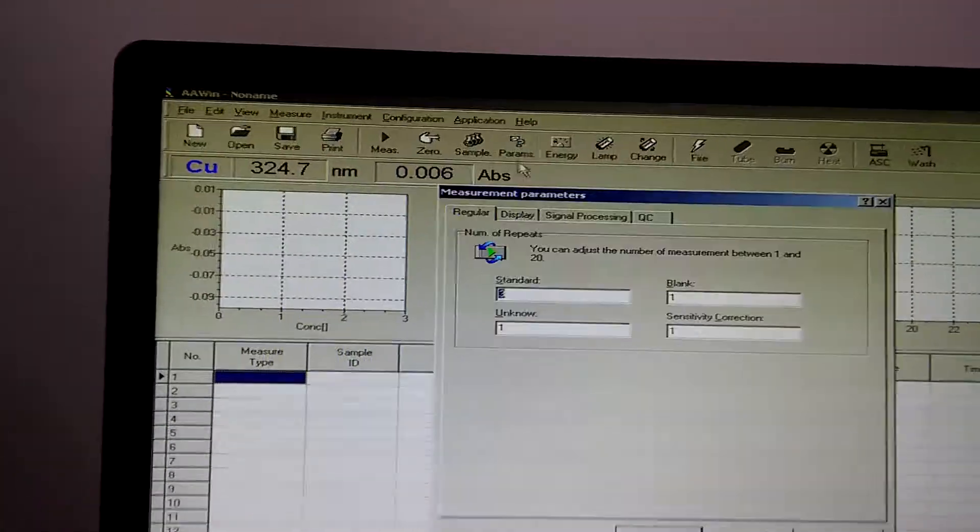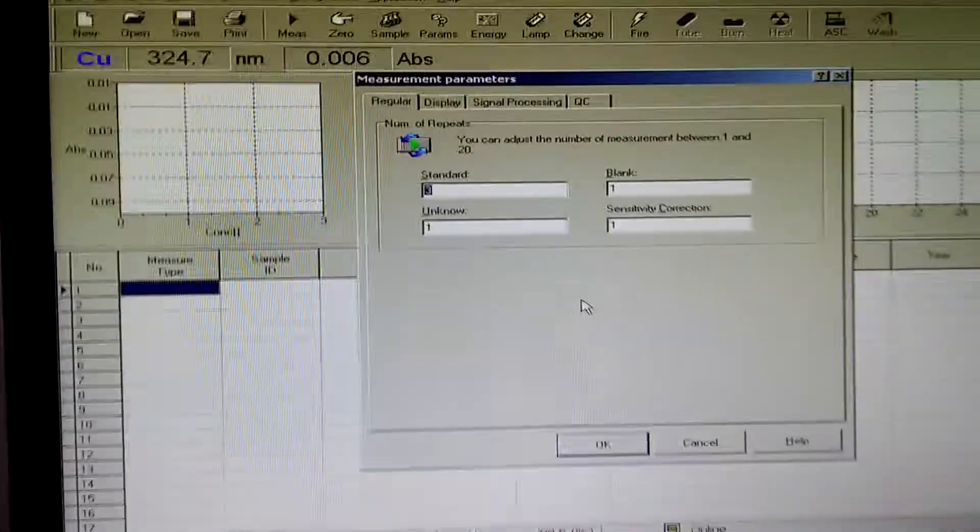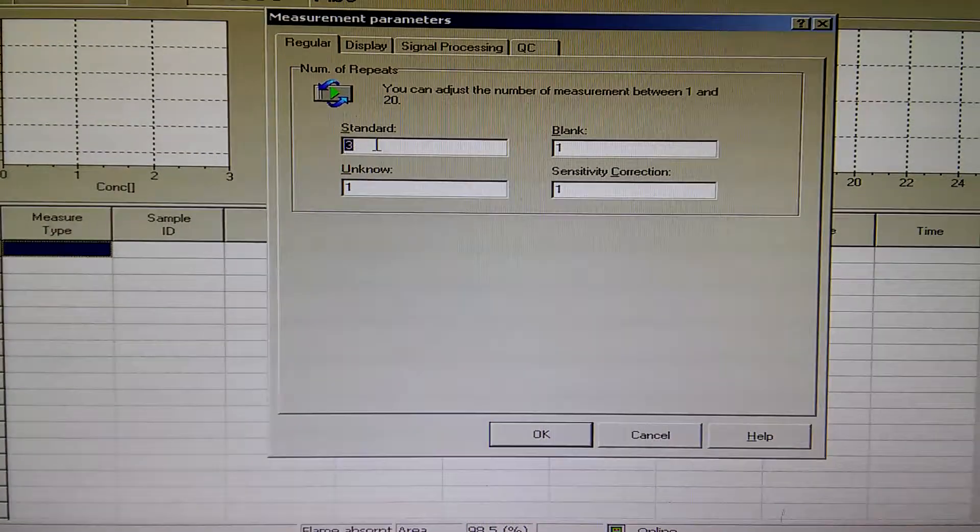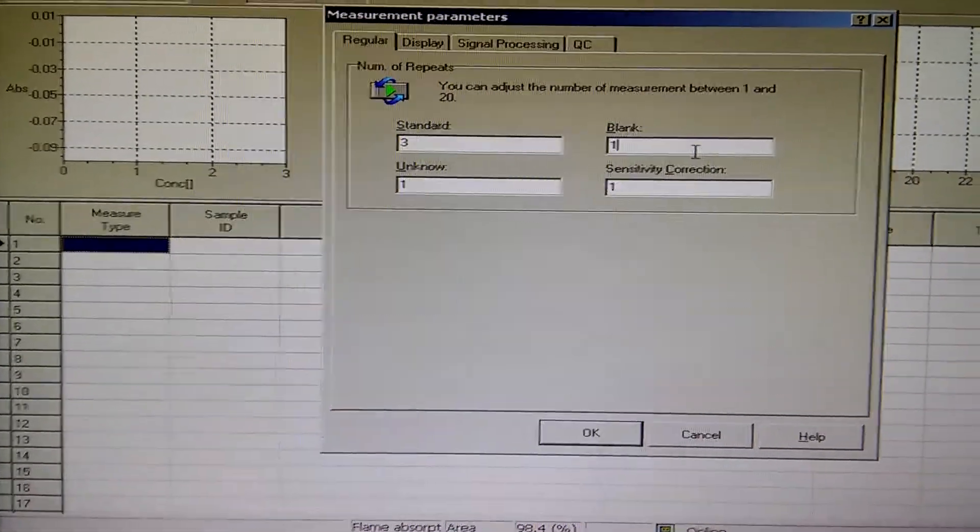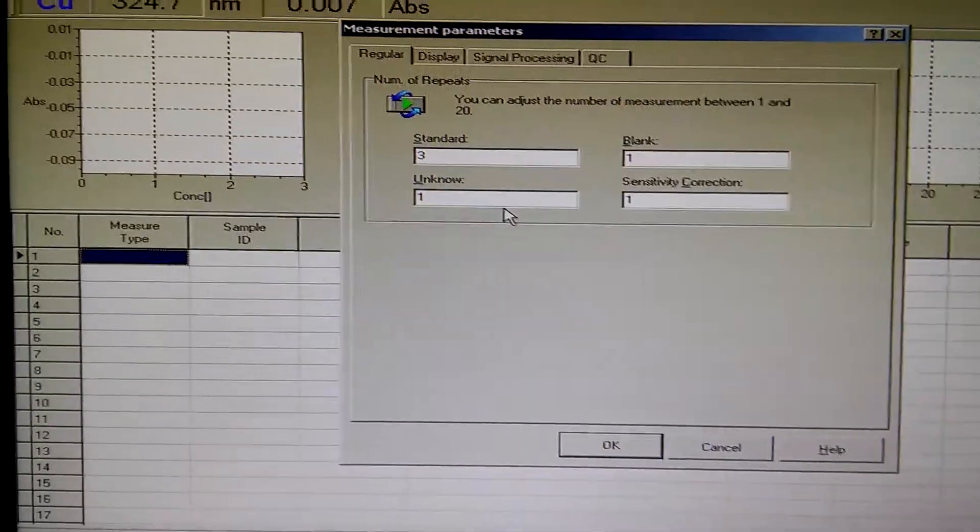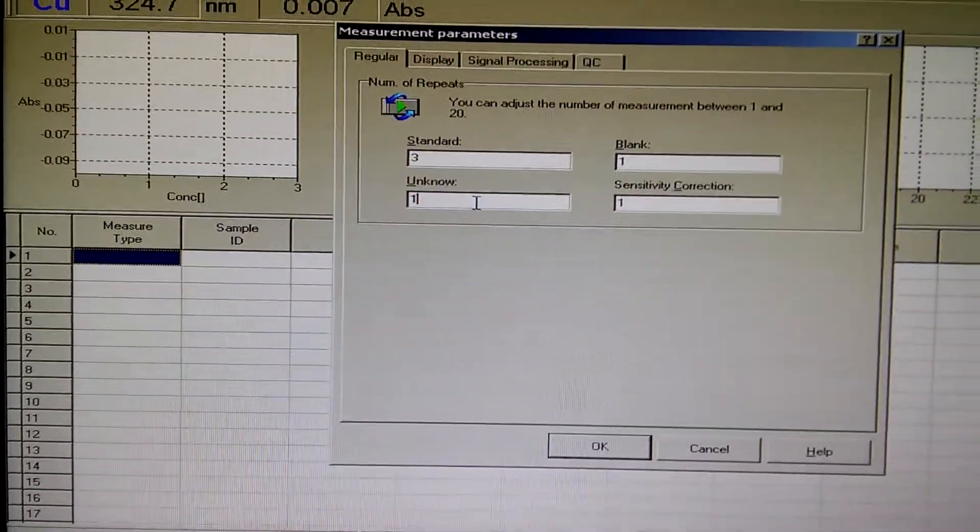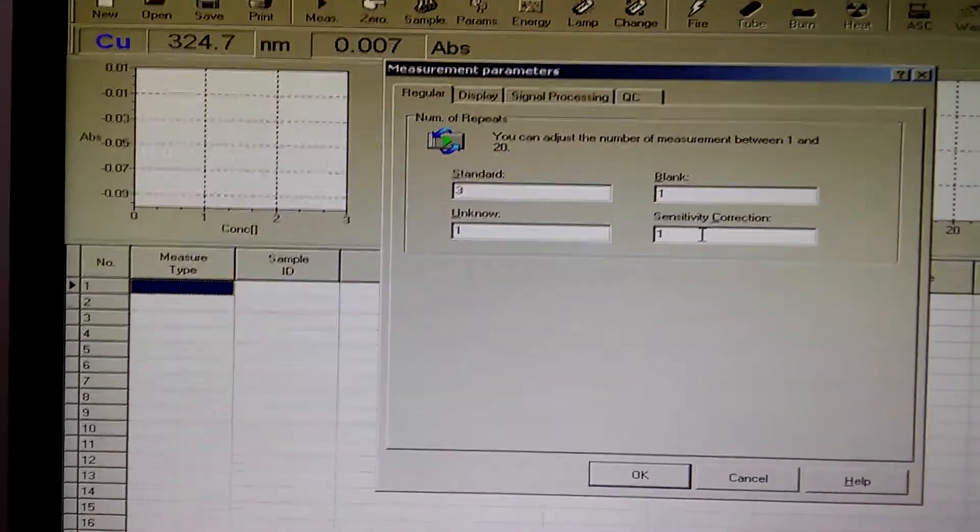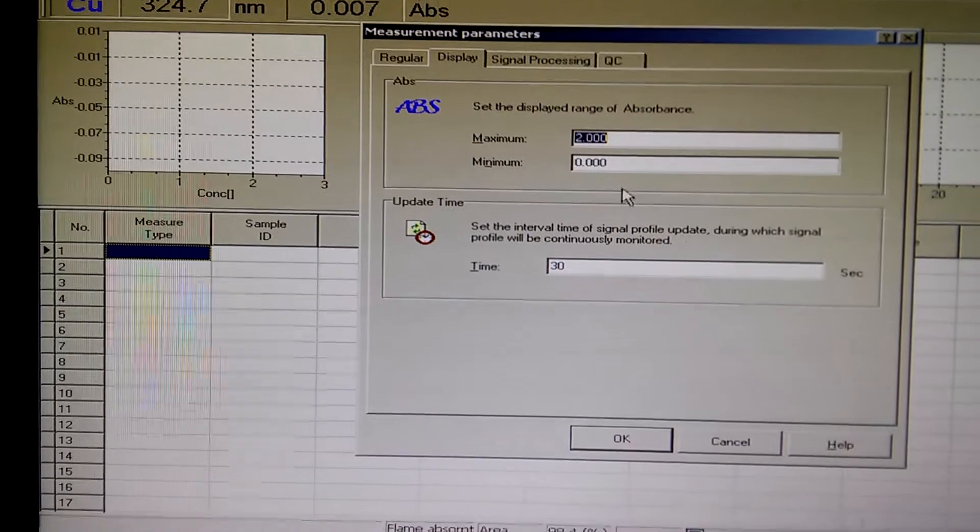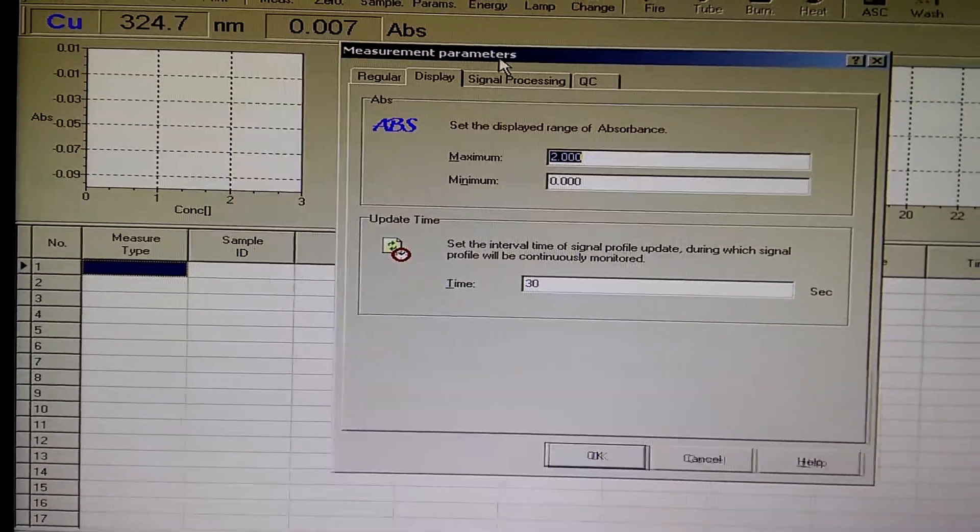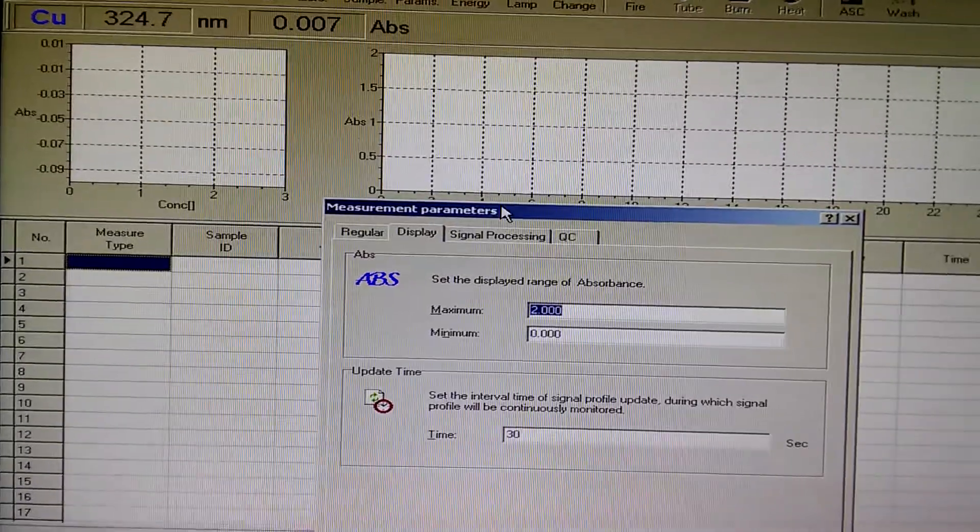Let's check the parameters. How many standards we are going to use? Three standards to draw the calibration curve with one blank, which is made of deionized water, and one unknown which has to be around 2 ppm in concentration. Sensitivity correction is one. Display between zero to two maximum.